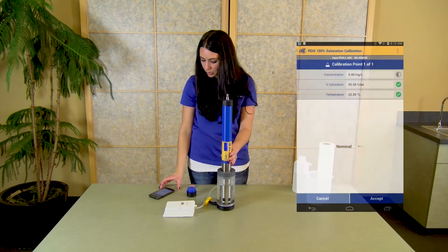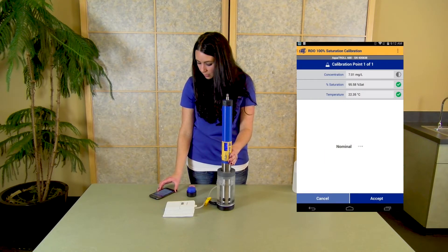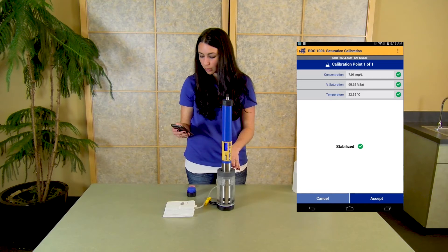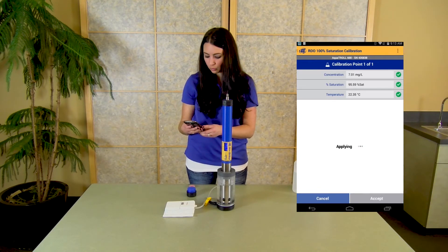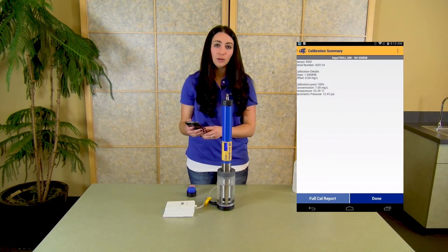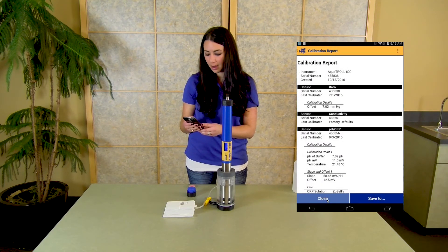Once you click next, the calibration will start and the app will guide you through the calibration. Once you have three full green check marks, the calibration is stable and you are free to click accept. From there, you'll get a summary of the calibration values. Click done and you are able to view the full calibration report.